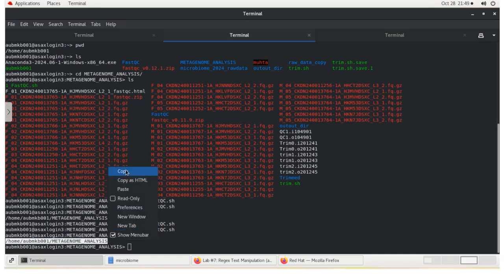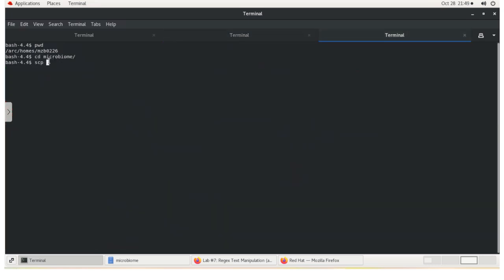Okay, so I have copied this, and then I will go here.